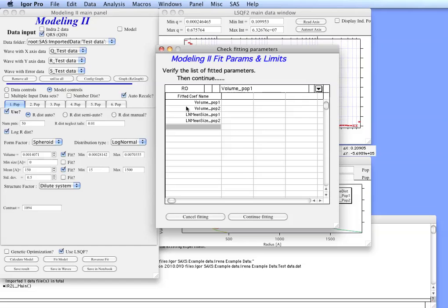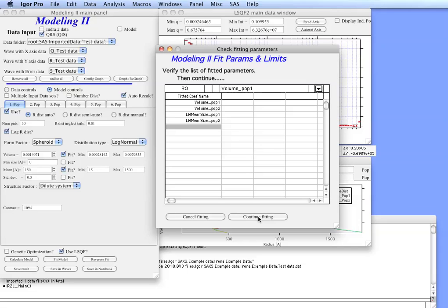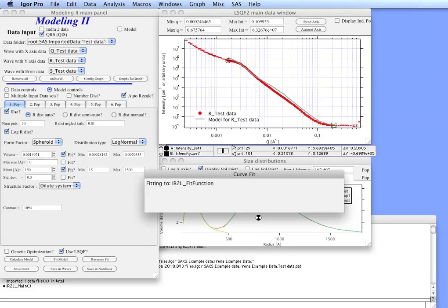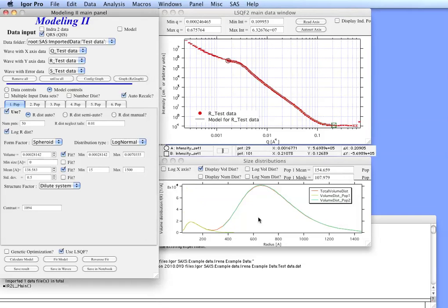So in here we can now select fit. Now you get a list here which is check fitting parameters. It's here mainly in case you will be using genetic optimization. Genetic optimization takes a long time but can sometimes get superior results to least square fitting. It's important to read the manual before continuing. So now we can continue fitting and you can see that we have actually fitted reasonably well the data.